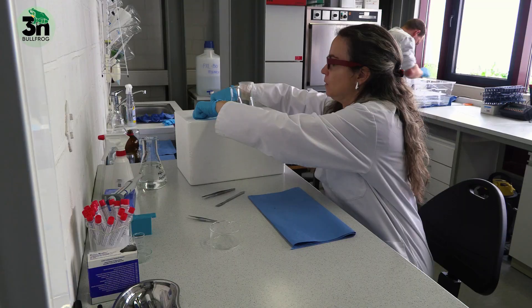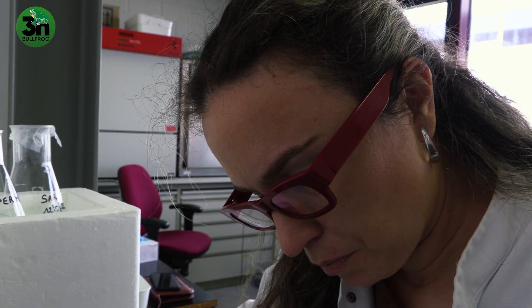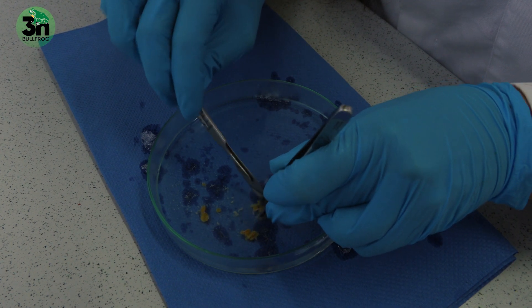In the next step we place those testes in a simplified amphibian ringer solution and we macerate those testes to make the tissue as small as possible and we retrieve all the spermatozoids within that solution.